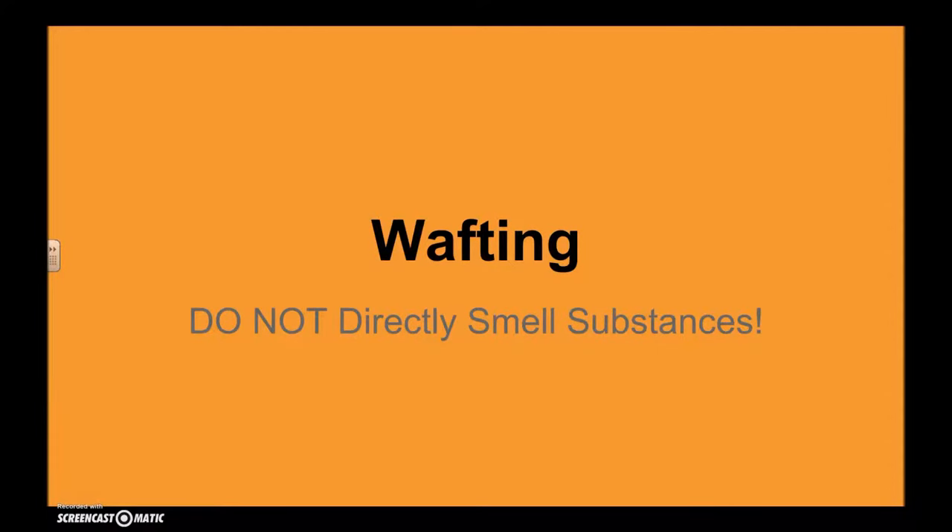In this video, we're going to quickly cover wafting. Wafting is a technique used when you're asked to figure out the odor or the smell of a substance. You never want to place your nose directly above a substance to detect its smell or odor. Continue watching for a quick example of how this is done properly in the science lab.